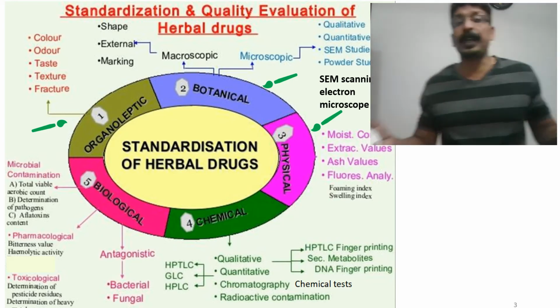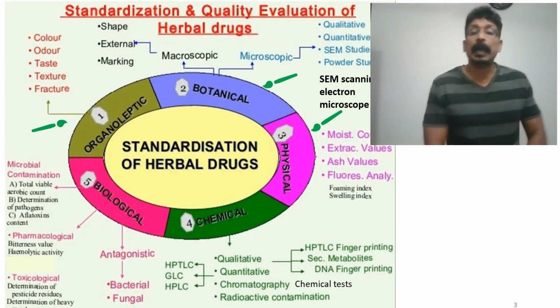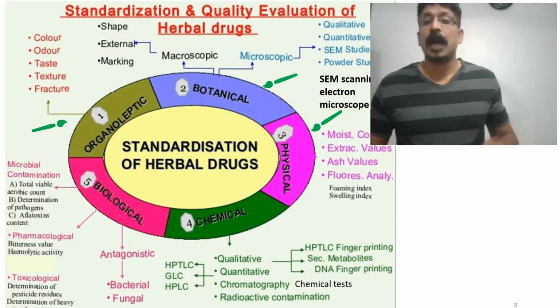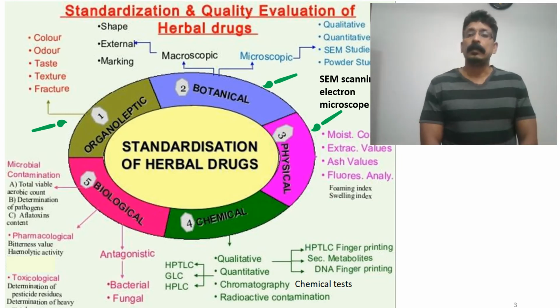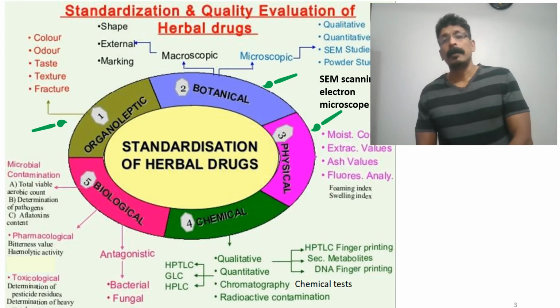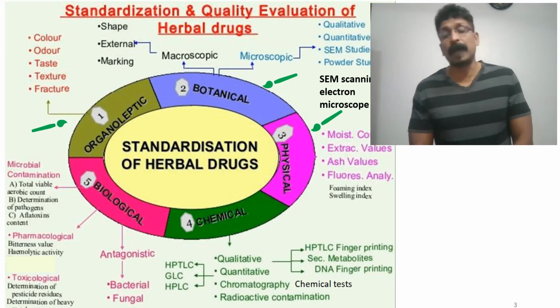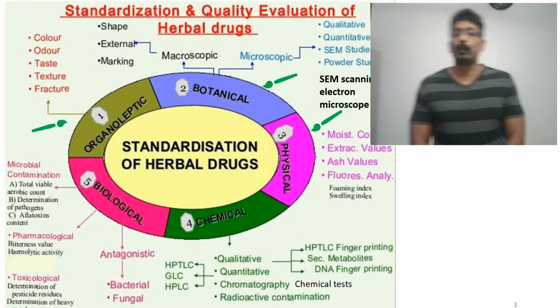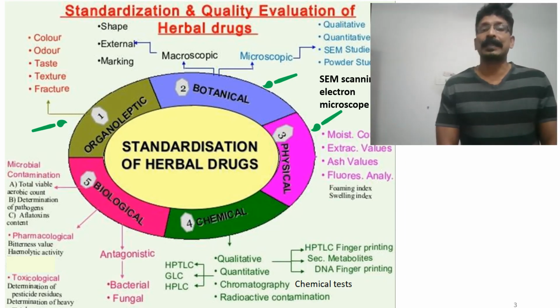So all of them, you should know about chemical evaluation, how you perform it, not only for herbal drugs, even for other normal tablet, capsule, syrup, orals, injections, anywhere, wherever, vaccines, anything. If you want to do it, you should know about all the operations of instruments and how to perform this chemical evaluation, standardization of the drugs.